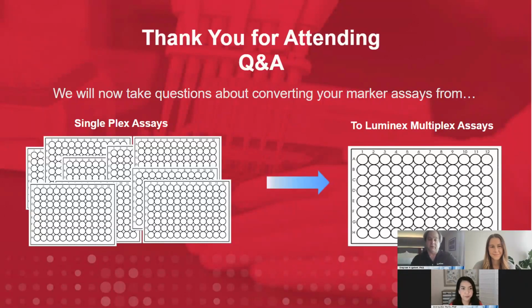And literally, when you build your own assay, or we build an assay for you, the beads come as like 12.5 million beads per ml. And if you were to couple a whole 1 ml of those beads, 12.5 million, and use them at the recommended amounts we recommend per region in a well, you literally get enough beads for like 5,000 reactions. So that makes it very economical as well.